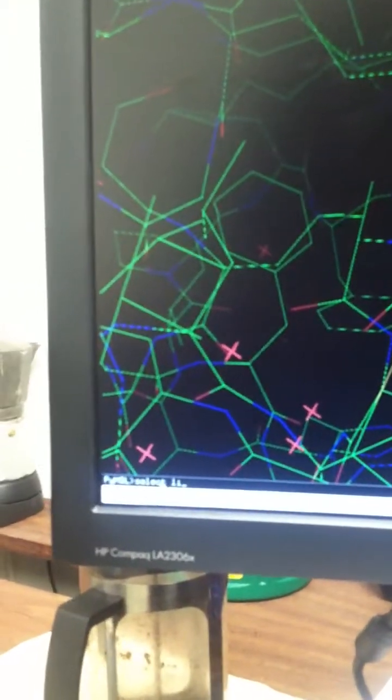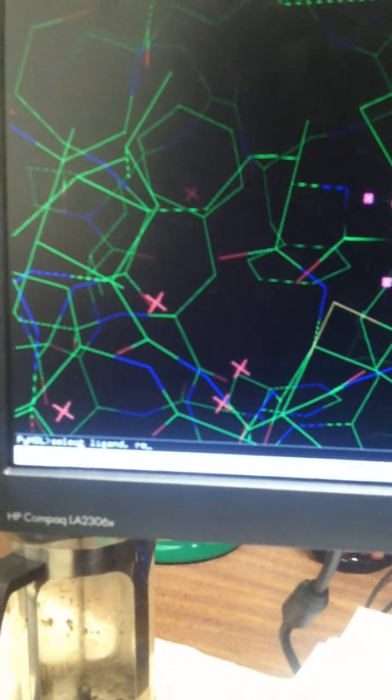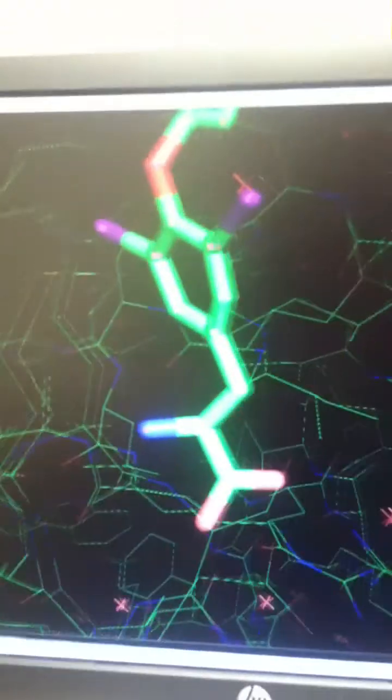So, select ligand. We'll name it ligand. And that's going to be residue, R-E-S-I, and 1, because I just told you it was 1. Enter. It's going to give me all of that. And so what we're going to do now is show this. See, I have iodine there, what I called it, and ligand here. And we're going to show the sticks. That made this 3D stick model pop up. And now we see it as a whole. Even better.